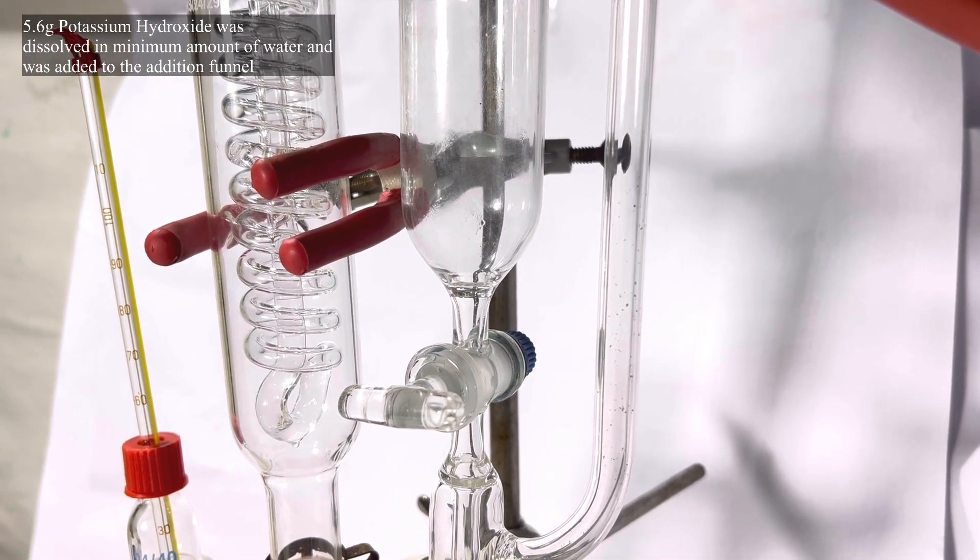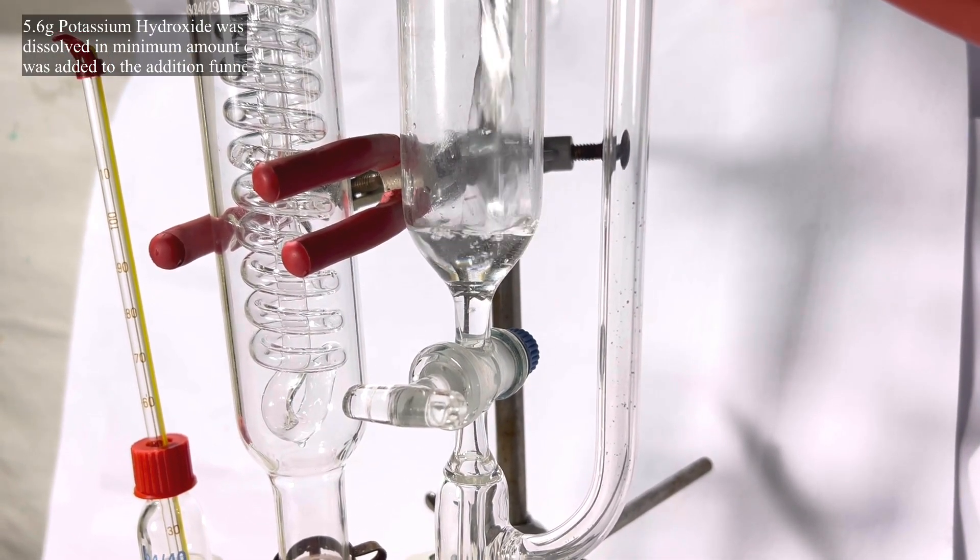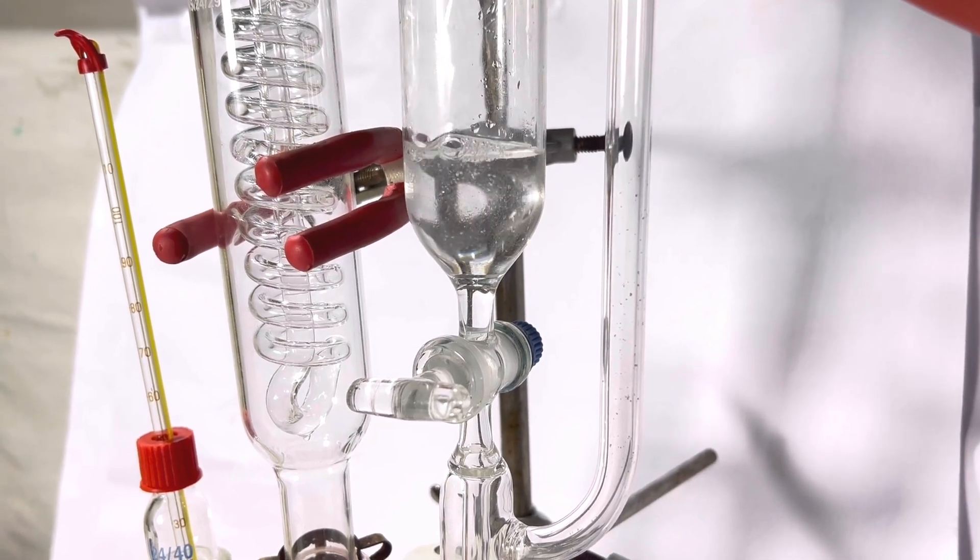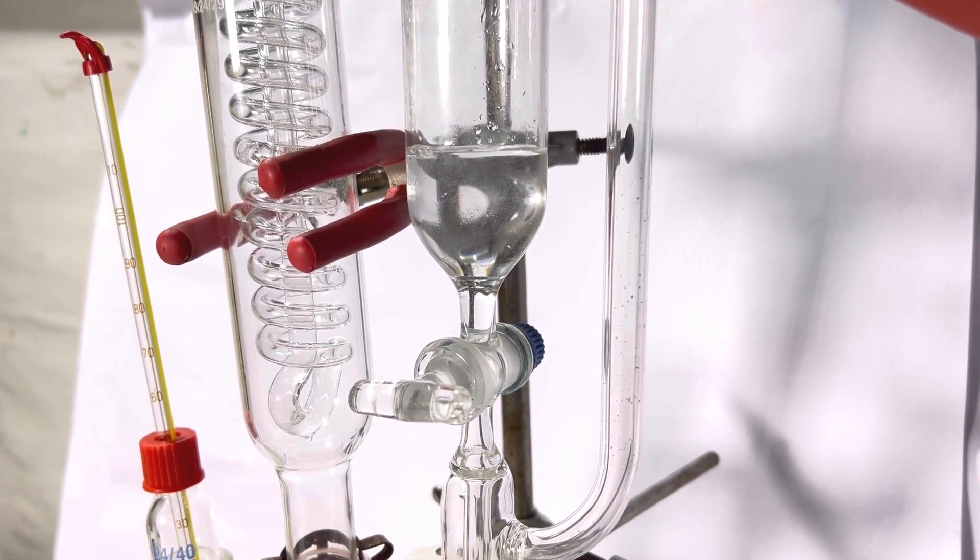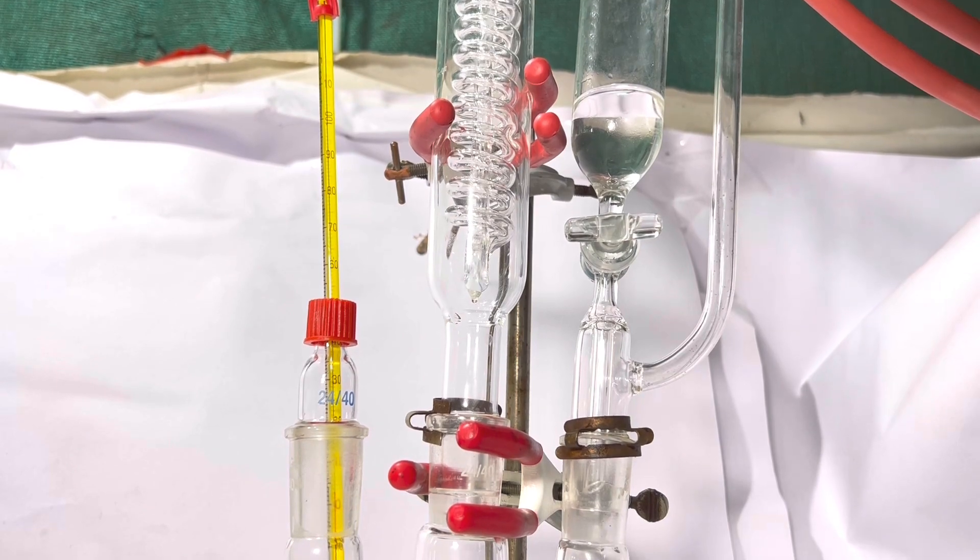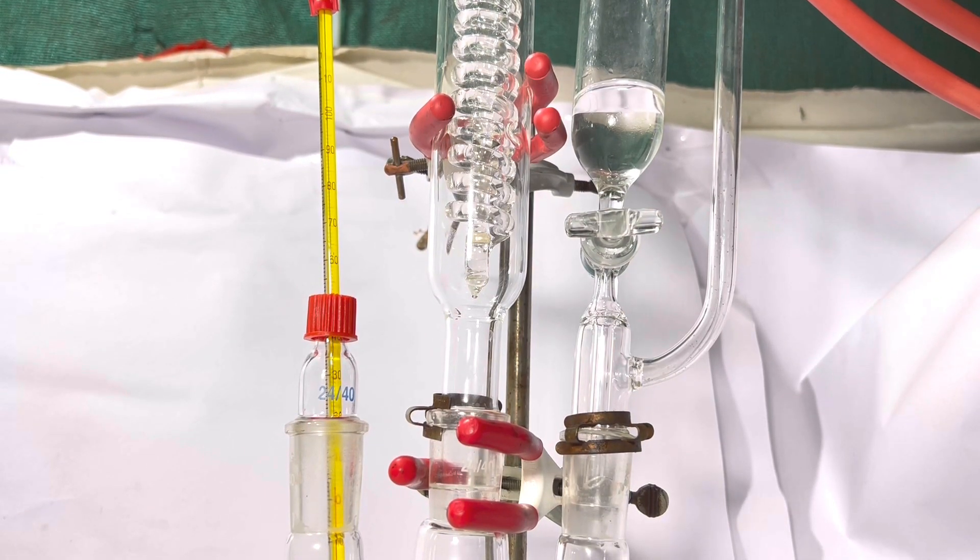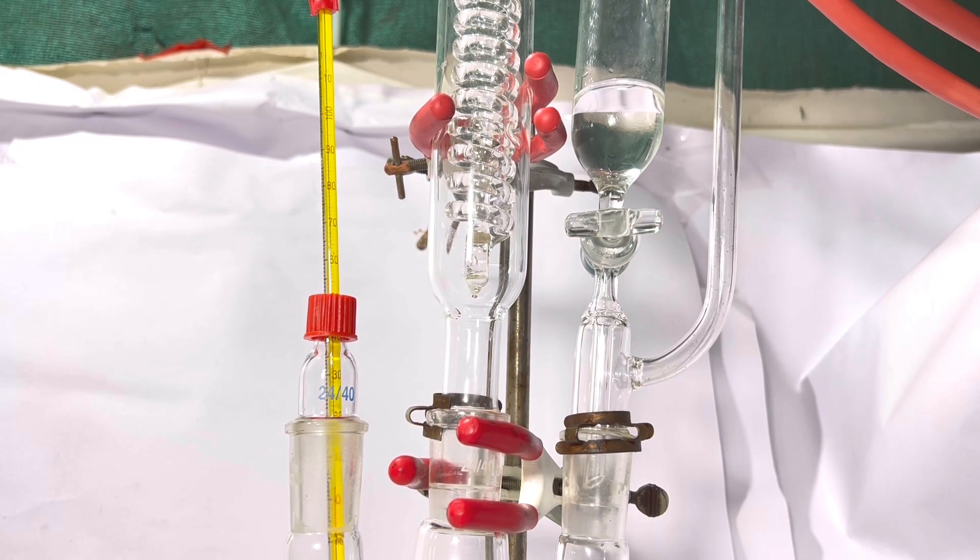Now a solution of 5.6 grams of potassium hydroxide dissolved in minimum amount of distilled water was added to the addition funnel. The reflux was then turned on and lots of ice crystals were dumped into the water reservoir to chill the condenser.